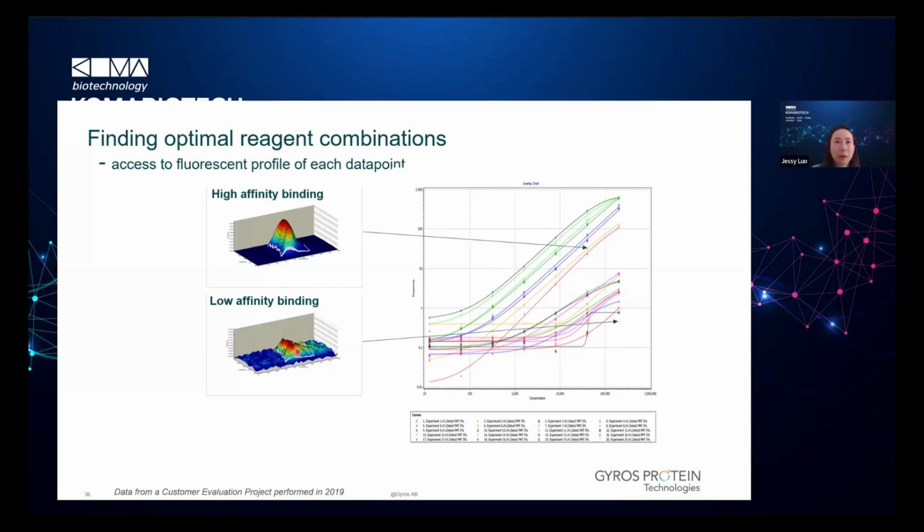But one thing here, it's not a quantitative analysis. If you want to compare that with SPR technology, it's not the same. We are not really doing dynamic affinity analysis, it's just like a final data of affinity. Okay. Yeah.